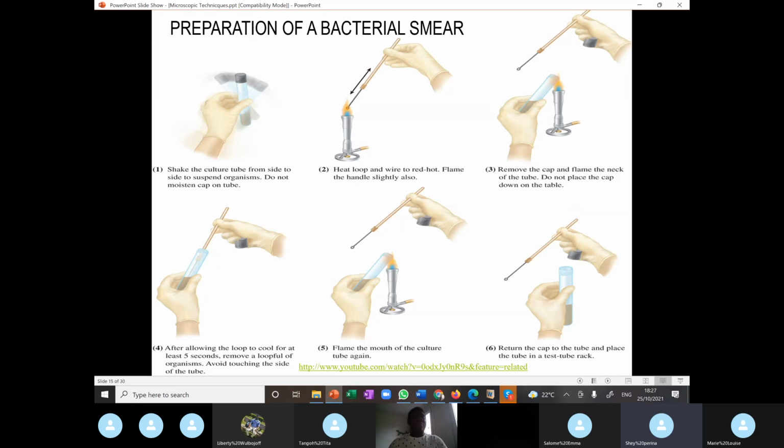So because they are everywhere and we want to visualize a particular organism that is supposed to be in our specimen, we'll have to always employ sterilization procedures to ensure that we don't contaminate our sample. We don't introduce a new organism into our sample. What we are visualizing is exactly what was inside our sample.